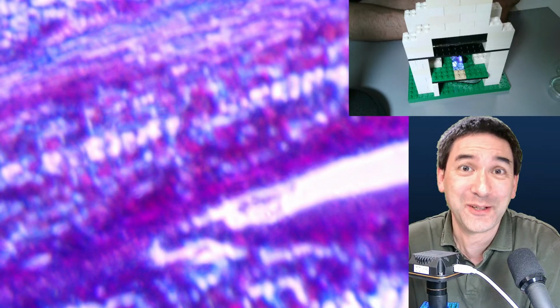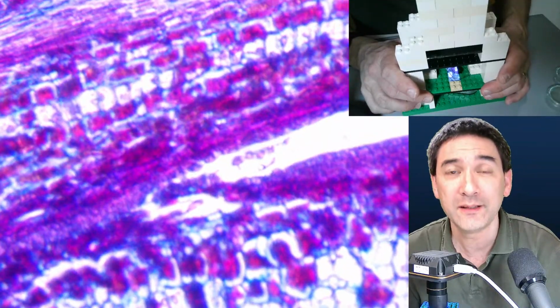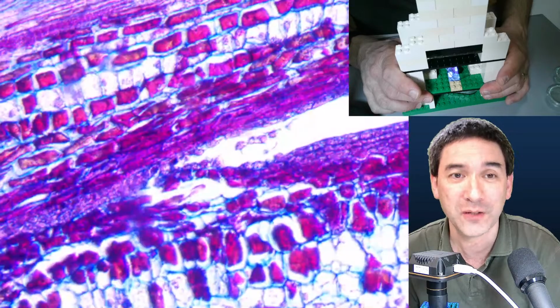And what are we going to do today? A whole bunch of miscellaneous material. I did announce that I would like to show you a Lego microscope. As a matter of fact, here it is. I'm going to explain it to you a little bit. You see that I've got a camera connected here as well. It's simply a little bit of a proof of concept, and you can also see the image that it's currently producing. I'll spend a couple of minutes on that.